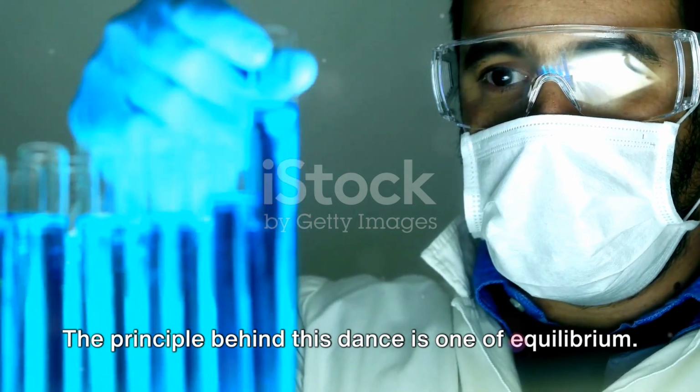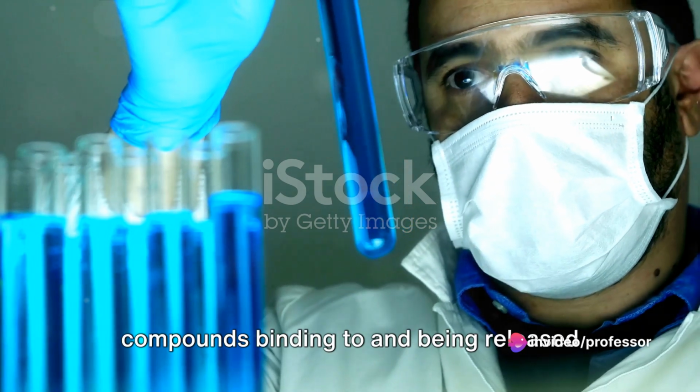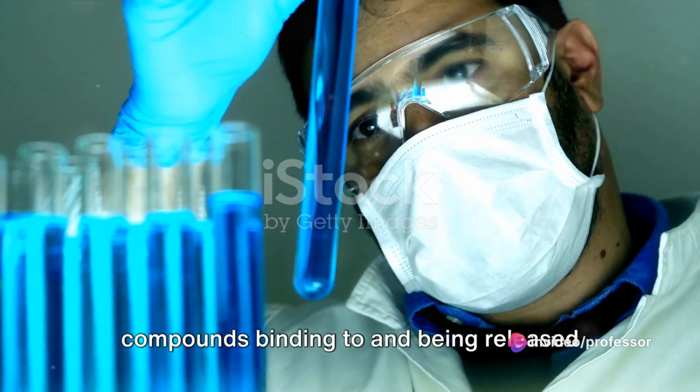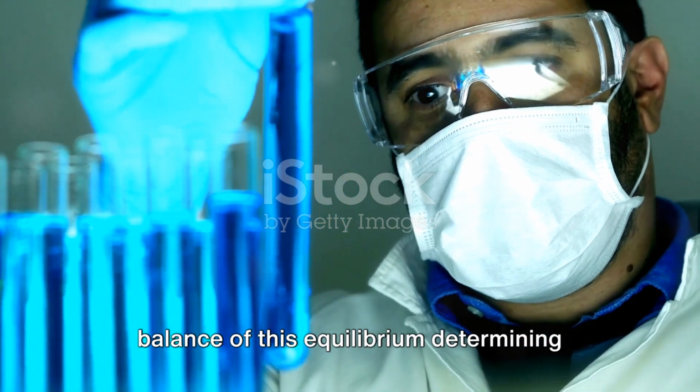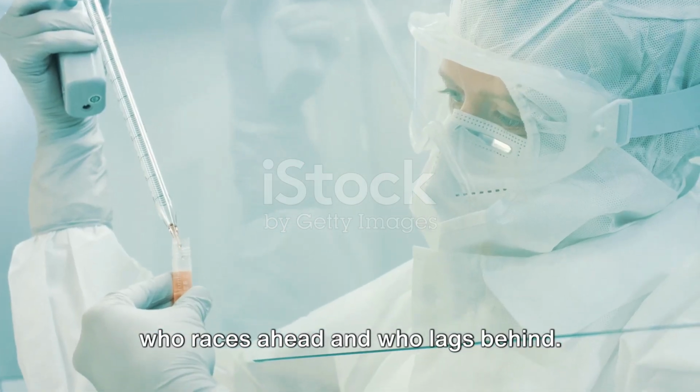The principle behind this dance is one of equilibrium. It's a constant back and forth of compounds binding to and being released from the stationary phase, with the balance of this equilibrium determining who races ahead and who lags behind.